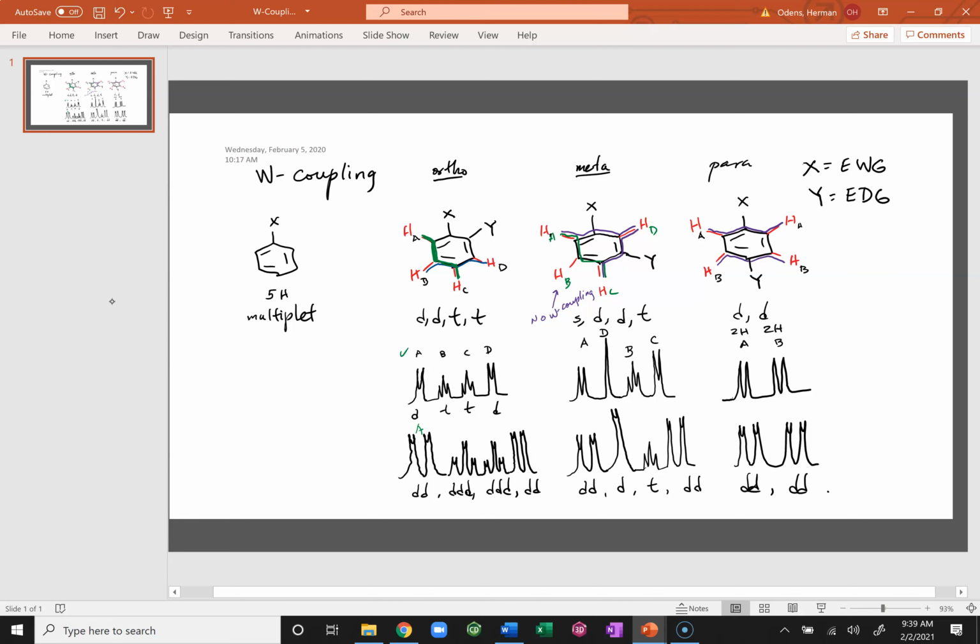And you will see that this is important for when you do NMRs that are online and in real life. Basically what I'm saying is in an ideal world, you expect the first set of peaks to happen. But in the real world, what you will see is this.